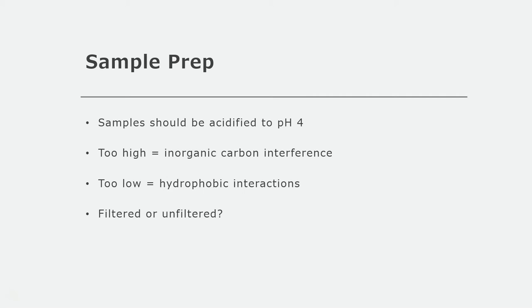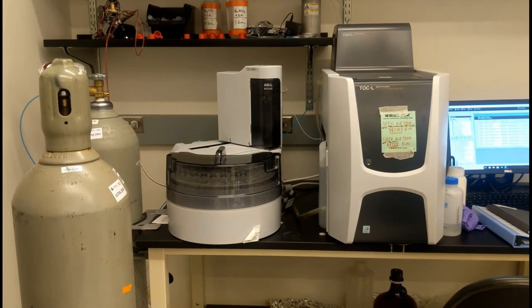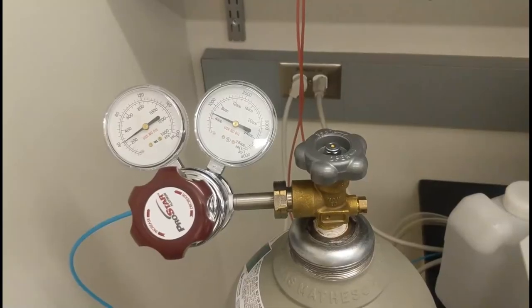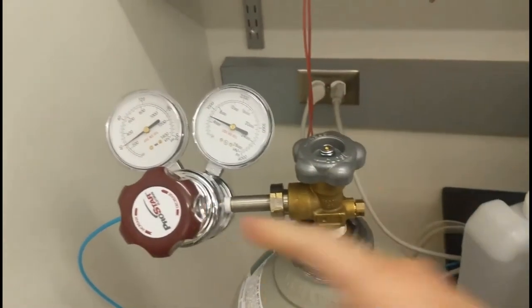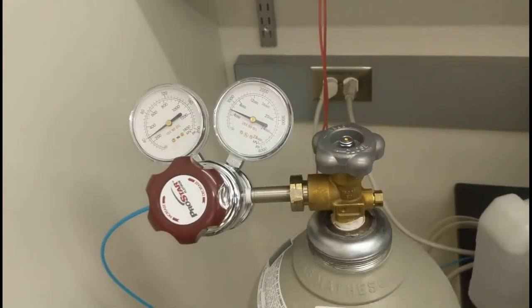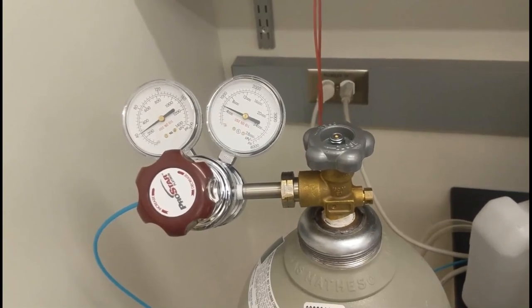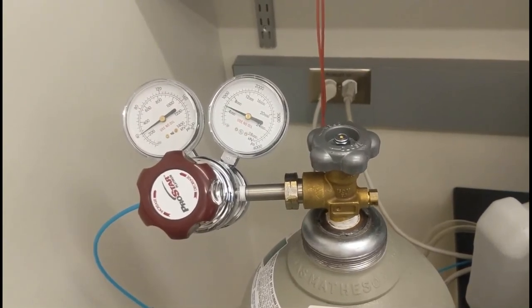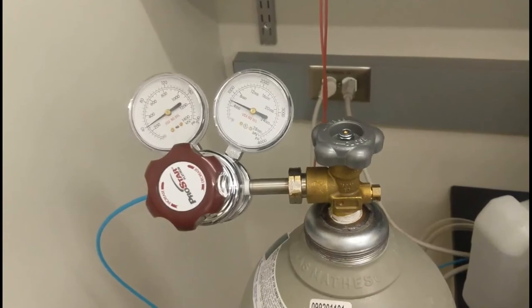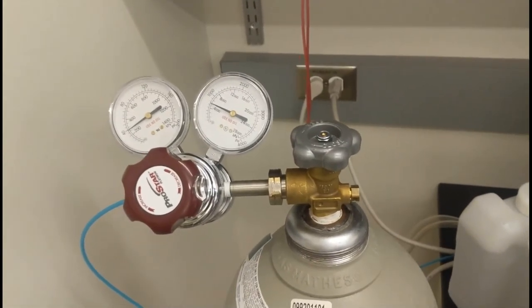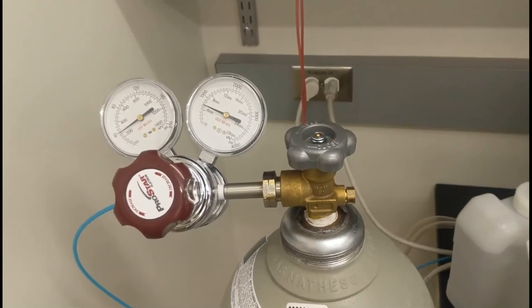Now let's take a look at the instrument. The first step is to open the main valve on the gas cylinder, and then open the pressure regulator. The pressure regulator should be set at at least 40 psi. If the flow rate is too high, you're going to get sloppy, inconsistent peaks, and if it's too low, you won't get any peaks at all. You also need to make sure that there's adequate pressure in the tank — if it's too low, you might run out of gas throughout your run. Keep in mind that for every 100 samples you run, it's going to use about 400 to 500 psi from the tank.